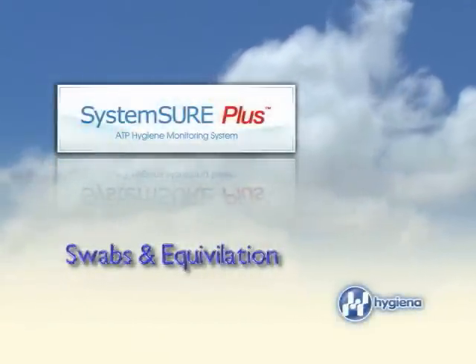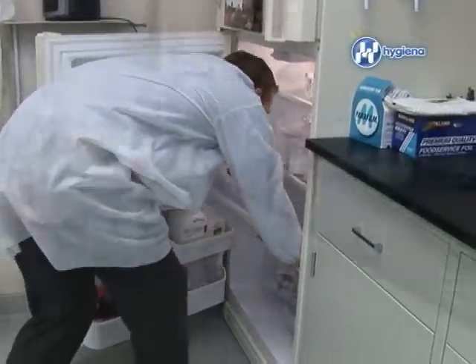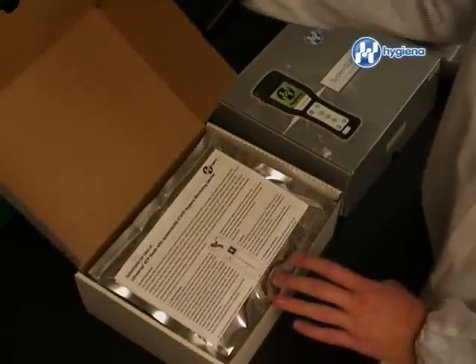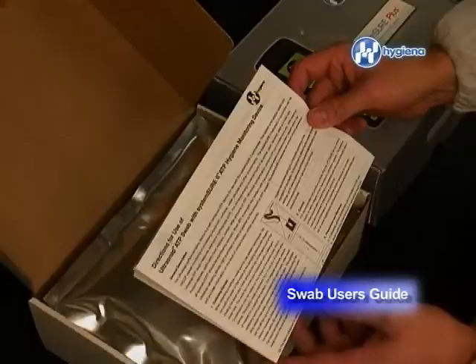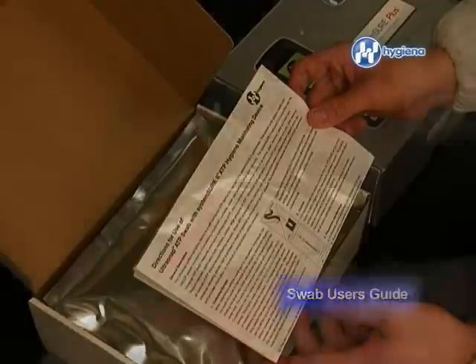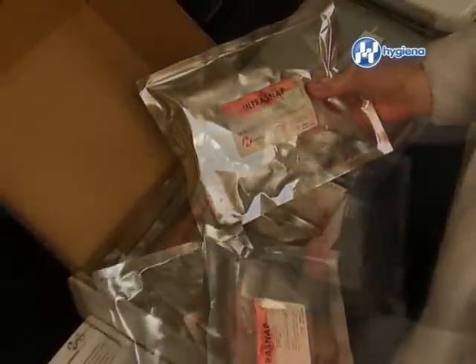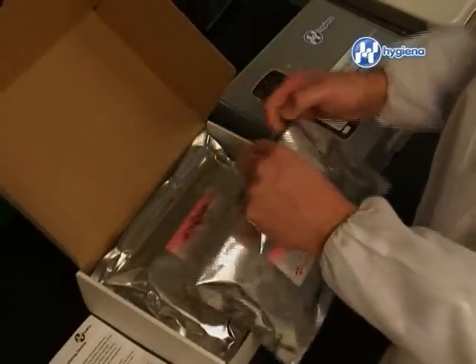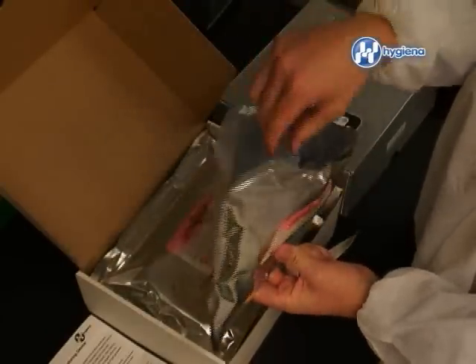Swabs and equivalation. Your UltraSnap ATP swab should be kept in a refrigerated area. When ready to use, remove the swabs from your refrigerator and place them in an appropriate area. A user's guide comes inside the box and should help you through the process if needed. The box contains 4 silver UltraSnap bags. To open, simply tear the corner of the bag and remove the desired number of swabs. Each bag contains 25 swabs for a total of 100 swabs per box.